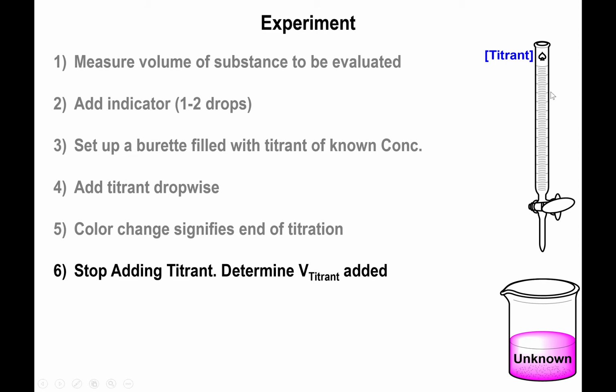All right, so wherever you land, you have to end up with 2 decimal places, with the second decimal place being your guess. You have to look roughly where that meniscus lies to come up with a guess as to, okay, it looks like it's maybe halfway through, so it's a little bit more than 0.5 or 0.05, or it's a little less than halfway through, so it's a little less than 0.05, etc., etc.